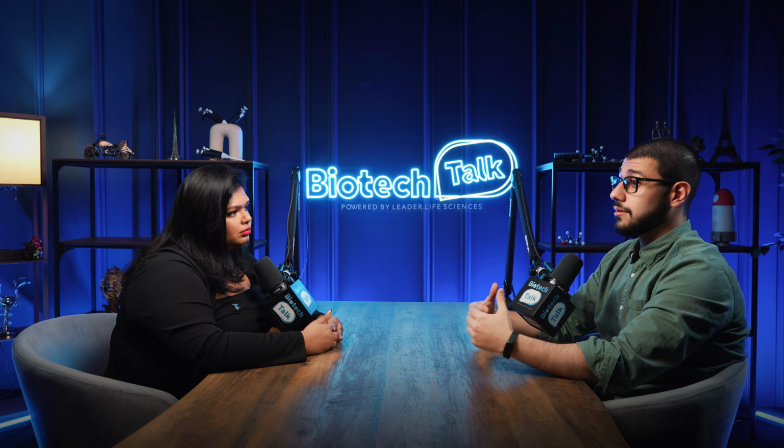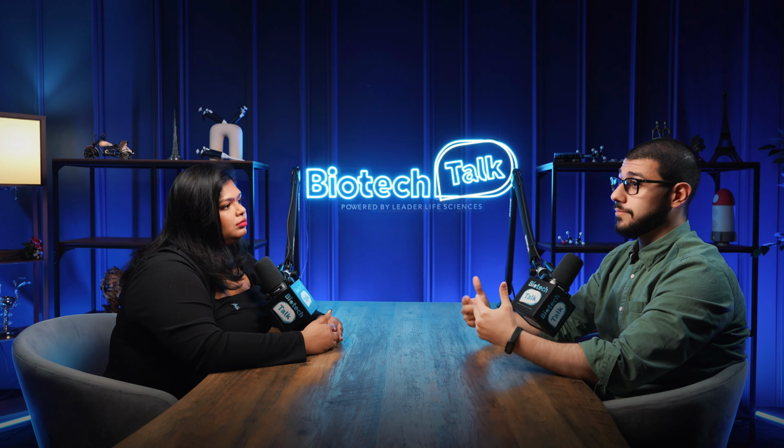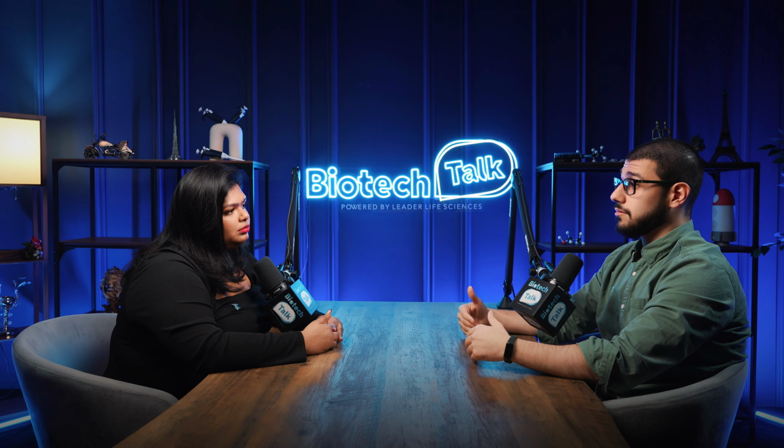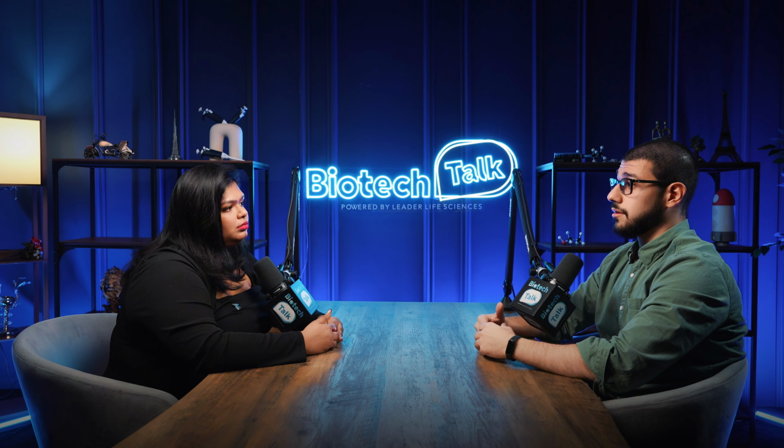Where I also would like to highlight, automation is really great. It's important. However, where we understood that we need to put more effort is in the training of the lab operators and technologists. Of course. With proper training, they get the freedom and comfort of working with these complex robotics. Then only we can really get the results that we are hoping for.